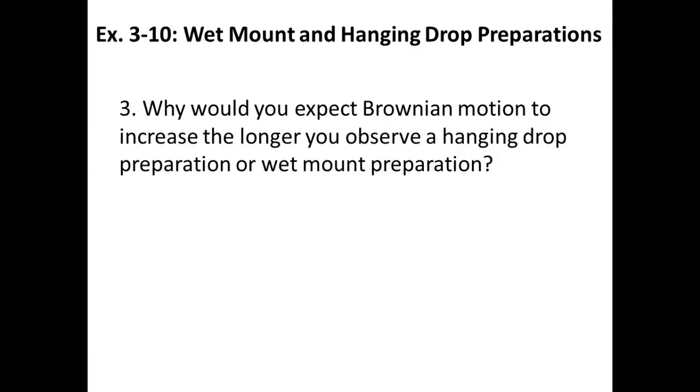And again, the more work you do with this kind of stuff, the more apt you are to recognize vibration over motility. But motility, as you can see, is random all over the place and in different directions, where the vibration is very subtle, and everything's kind of going at the same vibration. It makes me sick to look at stuff vibrating, though.